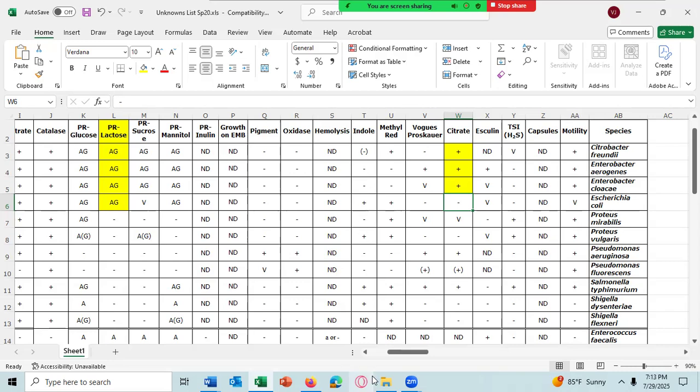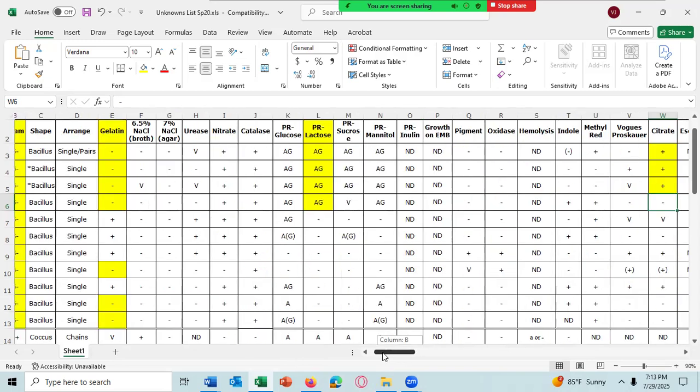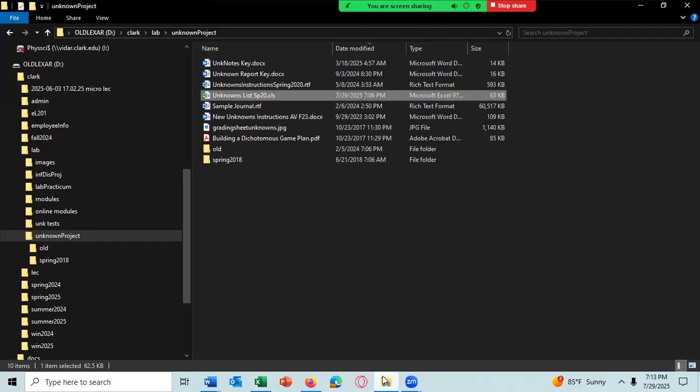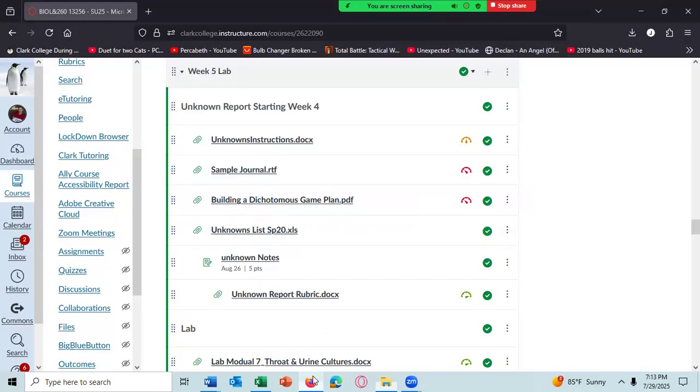The results I send you will be pictures for the different tests. You should obviously look at this table to see what the test possibilities are. And then you should also go look up the test. Let's see, I gotta go here. You scroll down here.